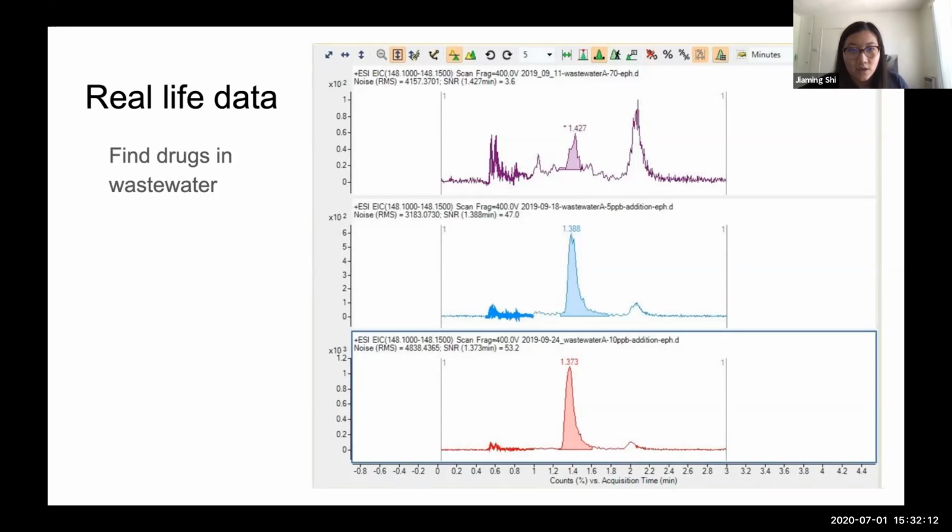So I collect wastewater samples from wastewater treatment plants, and I use LCMS. The LC part is the liquid chromatography, and the MS is the mass spectrometry, to quantify how high the level of illicit drugs present in our current wastewater is. We use mass spectrometry because HPLC with UV-Vis usually doesn't have that high a detection limit. So mass spec is more sensitive for very small concentration measurements.